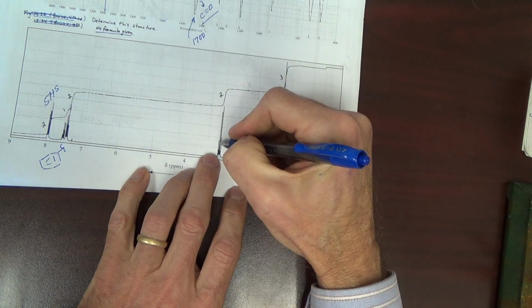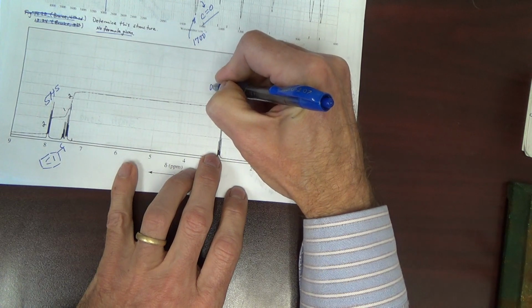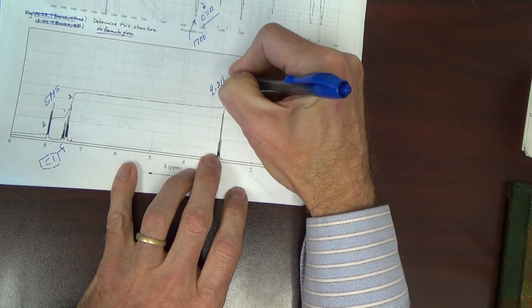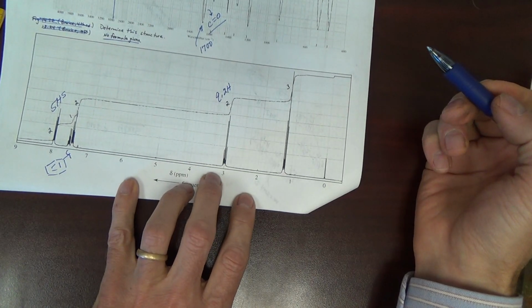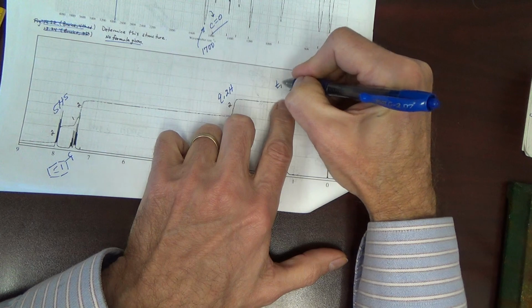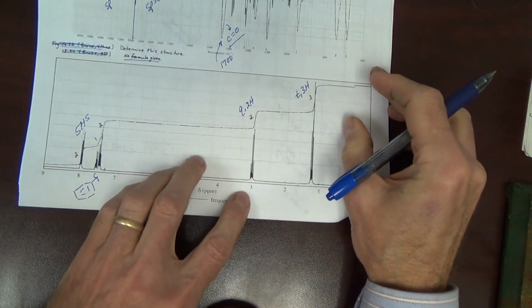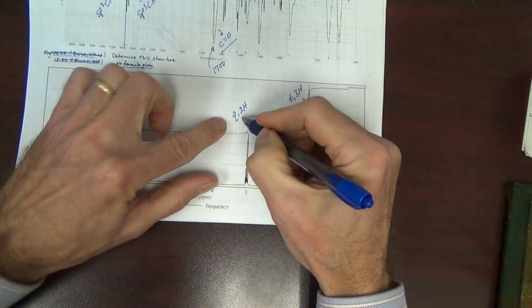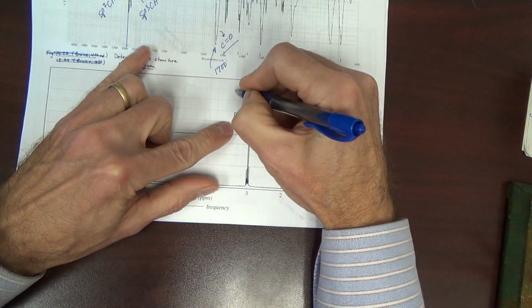This is a quartet, 2H. The 2 means 2H. This is a triplet, 3H. Quartet 2H means it's most likely a CH2.